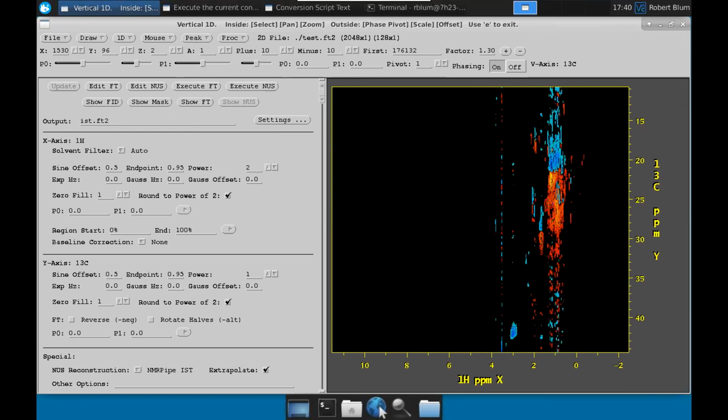Right. And of course, there's a huge number, and it's a giant mess anyway, because I have no idea what the spectrum is actually supposed to look like. So this data is gradient enhanced. And gradient enhanced data, when it's converted in NMRPipe, often requires a 90-degree phase correction in that dimension. So when you see data like this, you could just stick in a 90-degree correction and see.